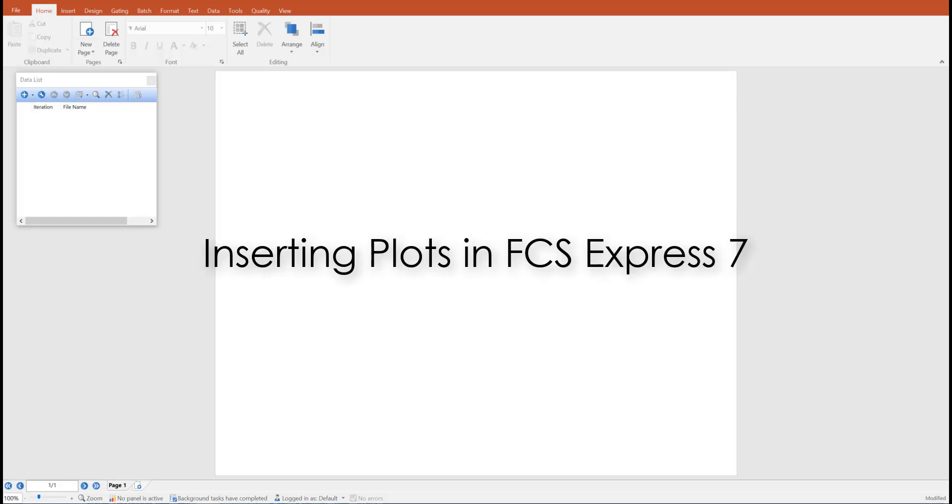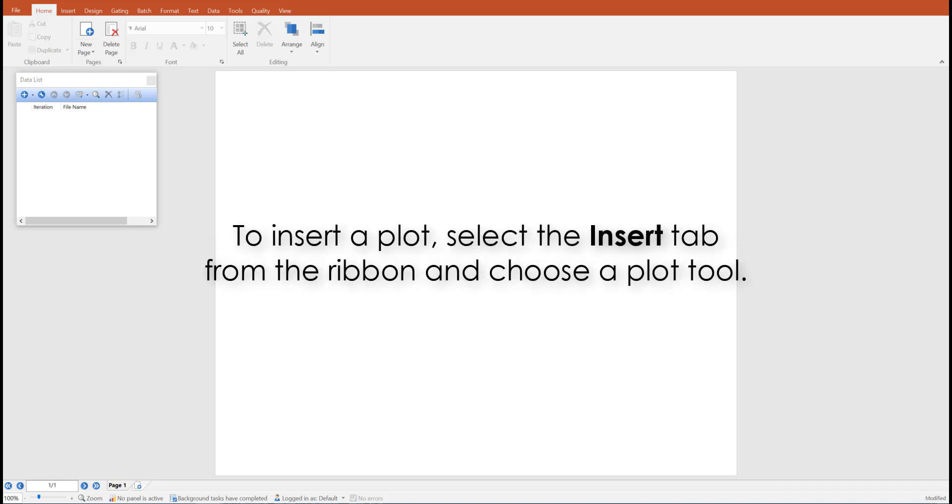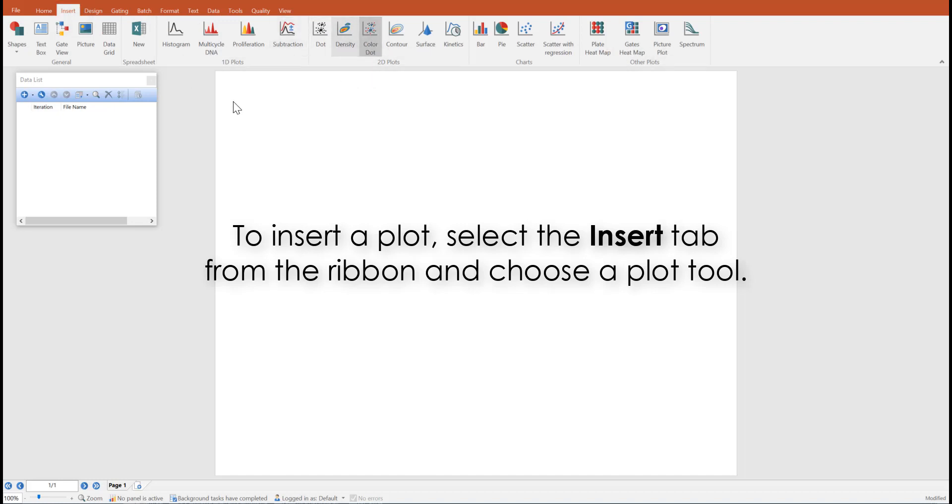FCS Express offers many different plot types to display your flow and image cytometry data. To insert a plot, select a plot tool from the insert tab in the ribbon. Click on the tool and draw the plot in the layout.